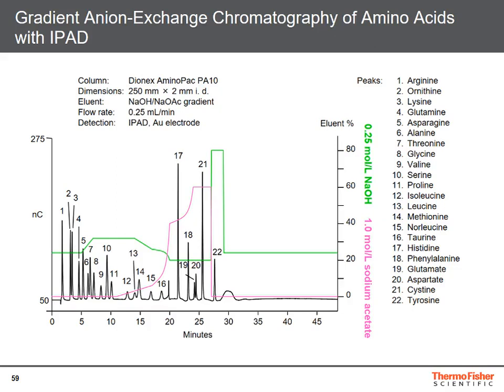When we compare anion exchange separations with those on cation exchange columns, the only difference is the elution order. Arginine eluting first on an anion exchanger, as an example, elutes last on a cation exchanger. The time for both separations, anion or cation exchange, is very much the same.